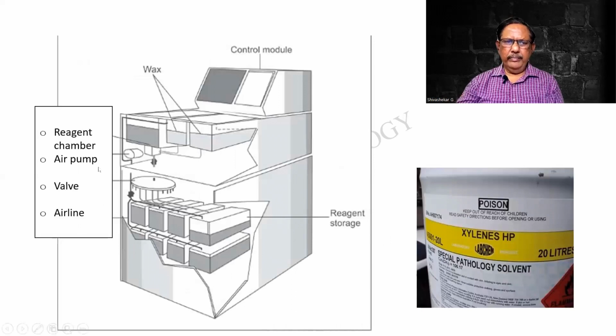Look at this one again. So these are the various things. This is a beautiful one. Are you able to see the wax over here? There will be the molten wax that is available. So it is separate. And this will be the trough where the various capsules can be put.